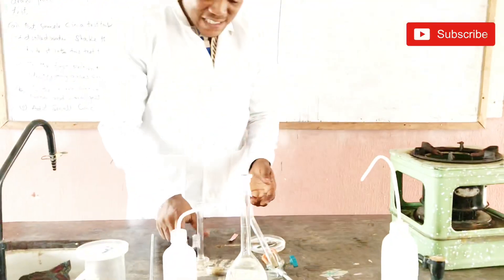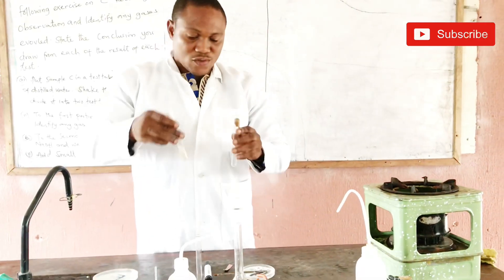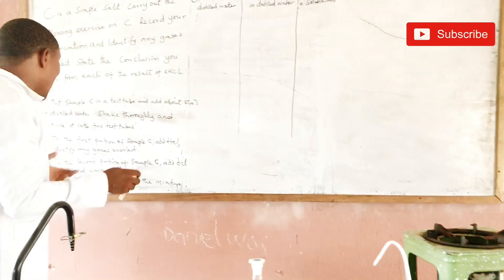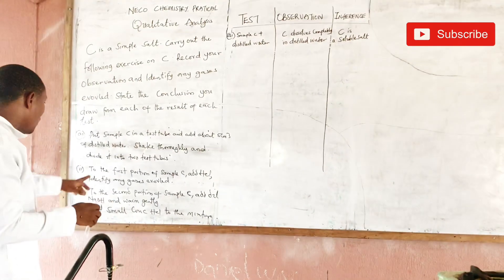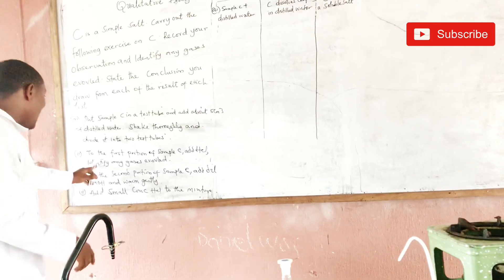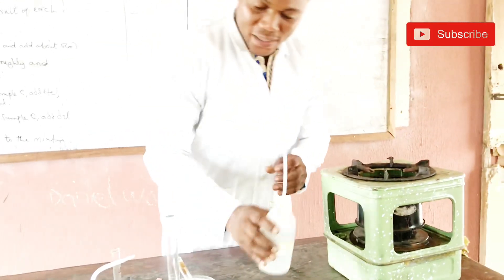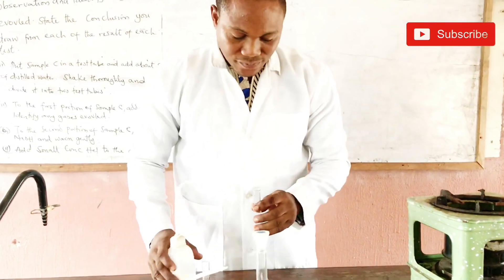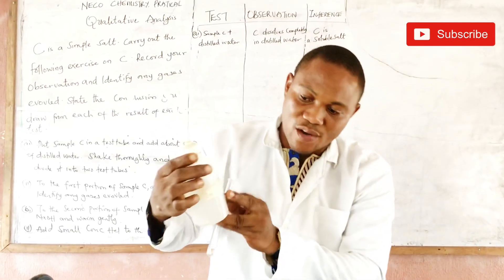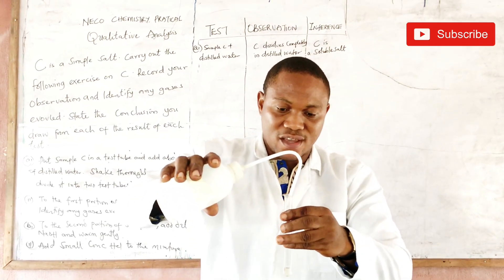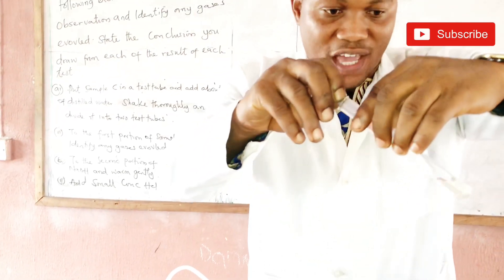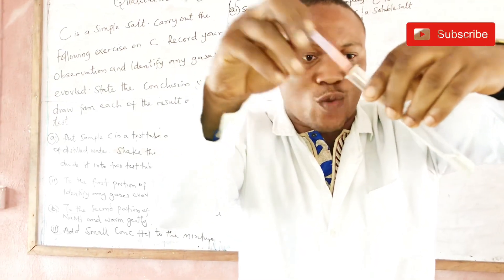I divide into two test tubes. To the first portion of sample C, add dilute HCl — identify any gas evolved. Pay attention: I'm adding dilute HCl to this now. On addition of dilute HCl, I can quickly test the evolved gas with my litmus paper. Number one observation: there is effervescence — that's the bubbling of gas in liquid, showing the evolution of gas.